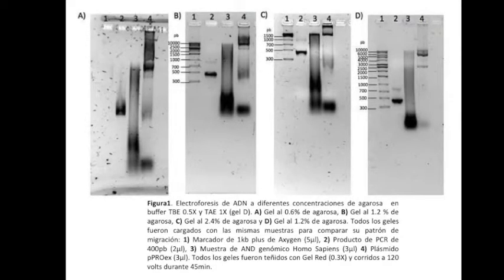The third gel was with 2.4% of agarose with the same conditions. In this gel, we see the molecular weight. In the second well, there is too much sample and it could be contaminated with DNA fragments. In the next and in the last well, the samples do not get out. In this case, the time was not enough and we need more voltage.